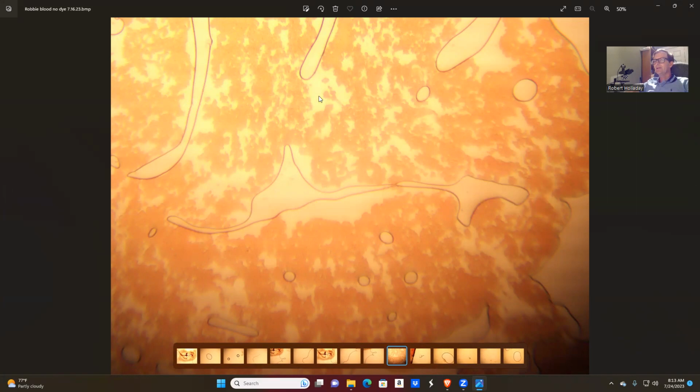And you can see these spaces here where there are no red blood cells. At first you see spaces, and then it morphs into white hydrogel, and then it turns into light blue hydrogel, which is what these are. And then, of course, those that took the potion have a dark blue hydrogel in them.